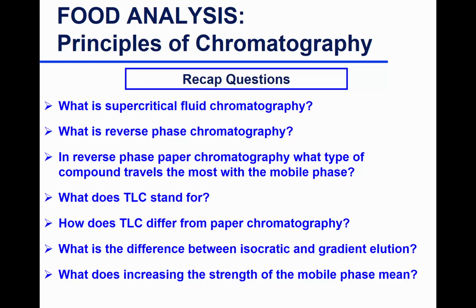In reverse phase, the only reason it's called reverse phase is because it started off with the stationary phase being polar and the mobile phase nonpolar, and that was normal phase chromatography. And then when they said, oh, we can do it differently, we can make the stationary phase nonpolar and the mobile phase polar, then it became reverse phase. And it works better for separation of nonpolar compounds than normal phase.